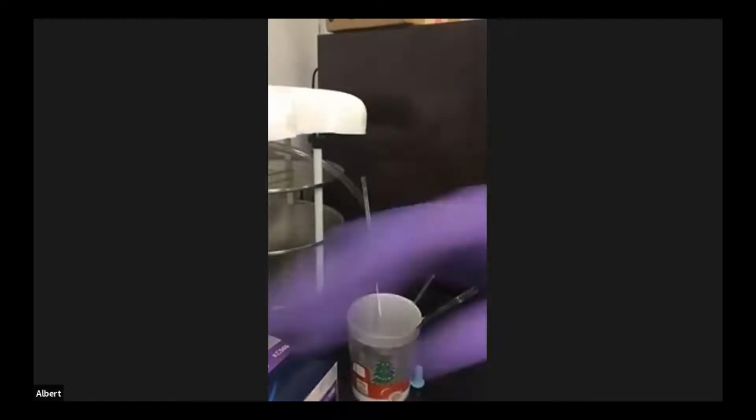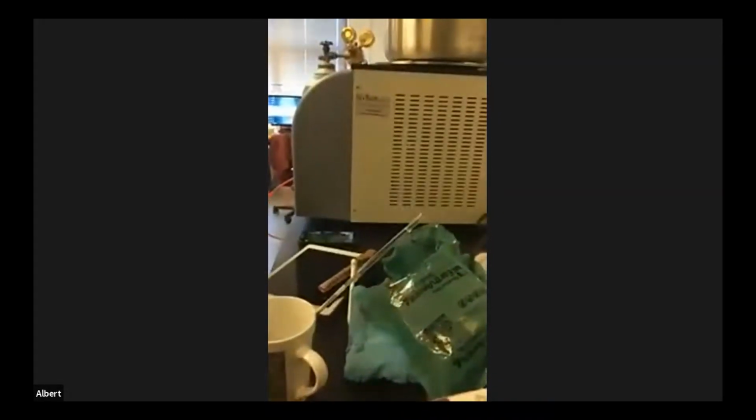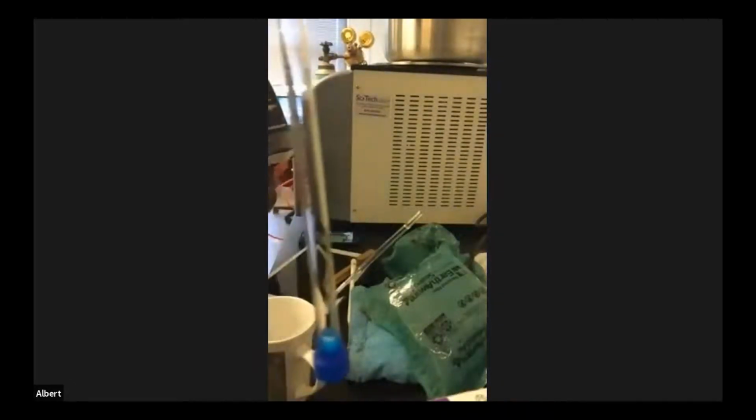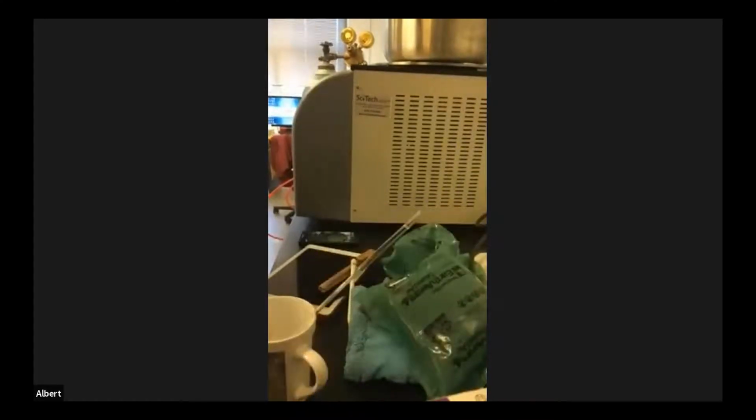So I'm just going to take this. Let me move this over here, that might be better, so I can see what I'm doing. You can see our NMR tubes with pipettes in them. So all I want to do now is just add some solvent to this to dissolve it up. Normally for NMR, you're doing 16 scans, and you want it to be about to here with solvent. So I'm going to add solvent to this.